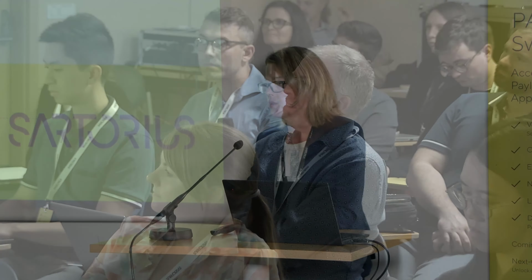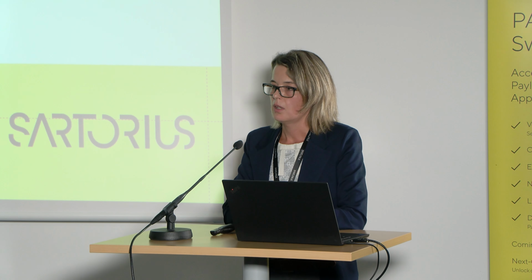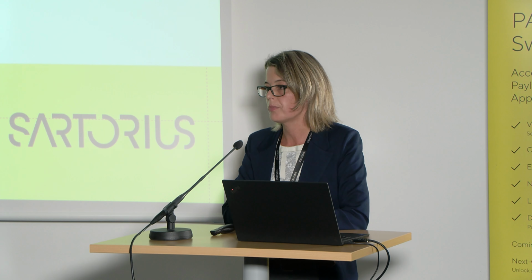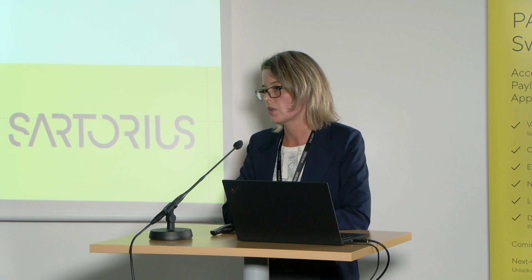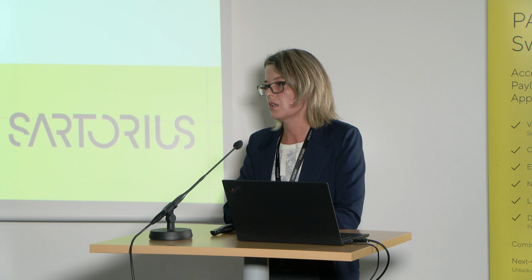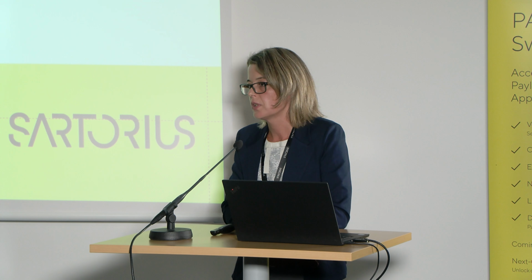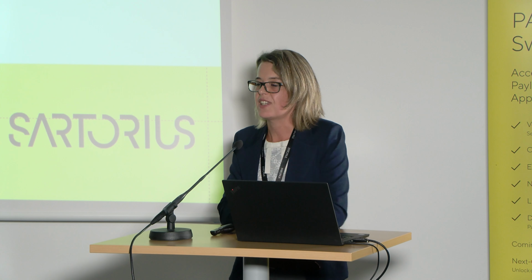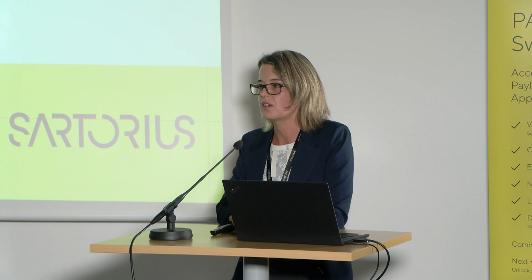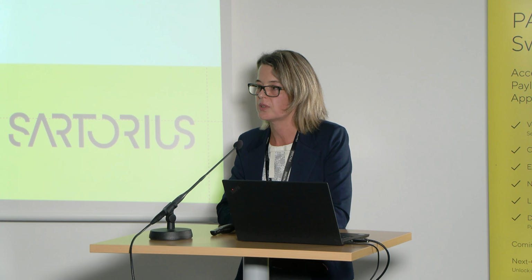Yeah, we try to leave it in because we want to avoid another process after the chromatography, and usually there is no problem with the citrate or other kosmotropic salt for the final formulation. But of course it's up to the client that is developing the drug product if they also want to change it at the end, or maybe it is already too high a concentration in the elution, and it can be regulated by diluting the final sample.